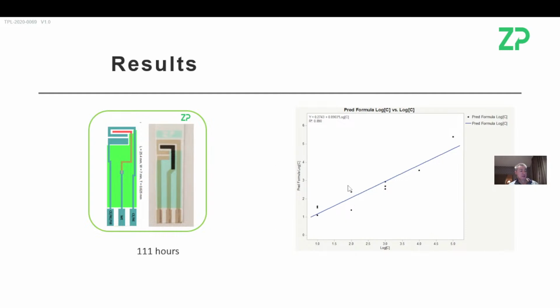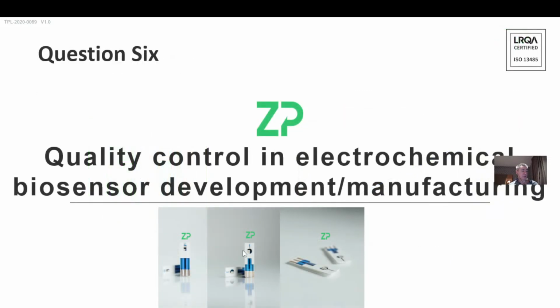There are 3 sensors here, 3 sensors here, 3 sensors here, 3 sensors here, and 3 sensors here. So you can see that at our limit of detection we start getting the most spread, but as we get more and more concentrated, of course, the signal becomes clearer. You don't even realize there are 3 electrodes underneath there. But I'm just trying to say that the data is not even perfect, and it takes 111 hours. So you've got to be reasonable about what you can actually achieve in academic research, especially in things like master's projects or bachelor projects. I've got quite a few slides on this now.